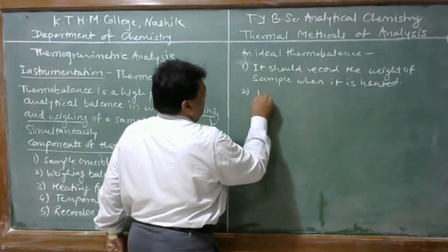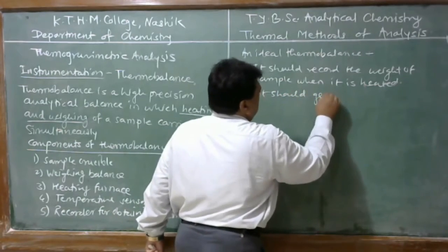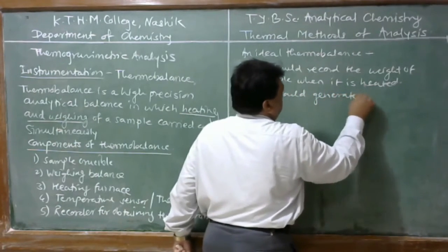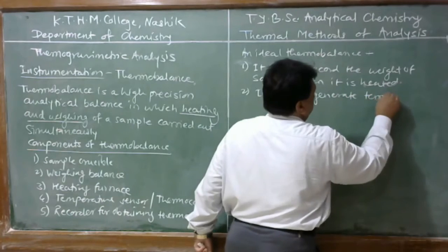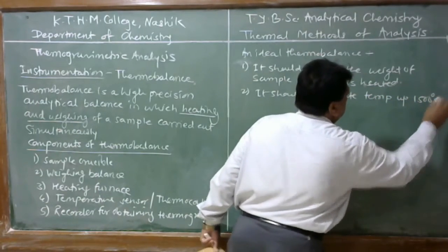Secondly, it should generate furnace temperature up to 1500 degrees centigrade.